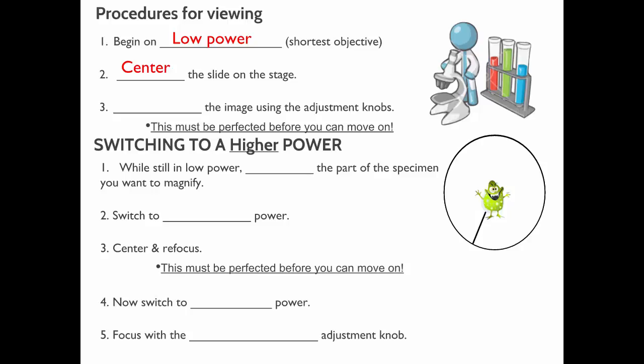Jordan? What if you have glasses? Wouldn't your glasses like clink? Yeah, they might. Try it with and without your glasses, see how it compares.